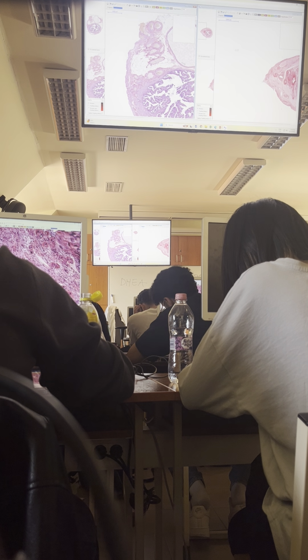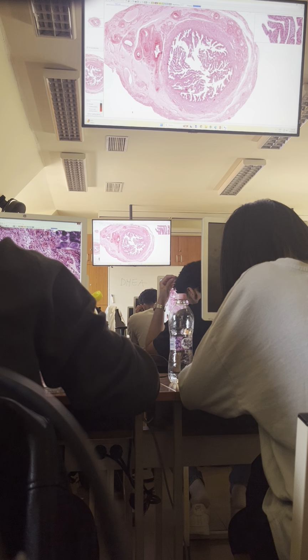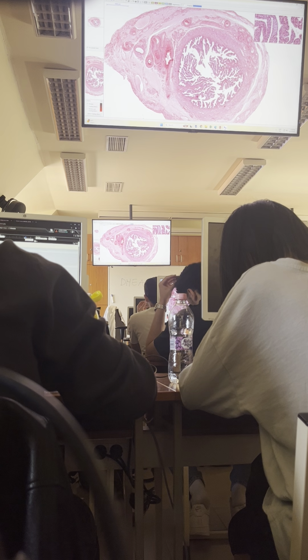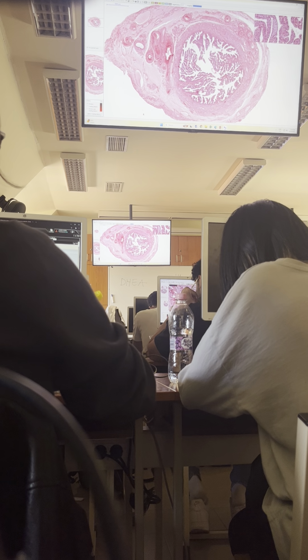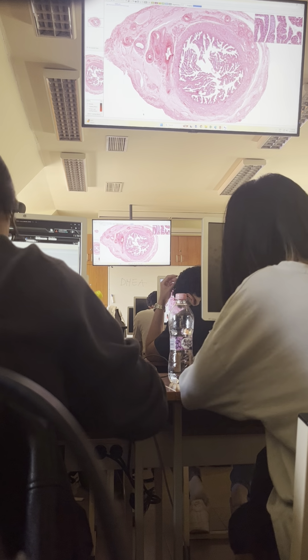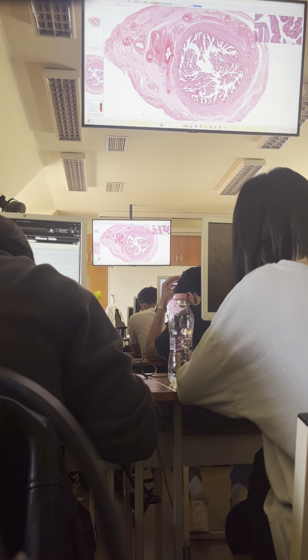So let's go to this 52-59 section, which is the uterine tube again, but in the progesterone phase. Here you cannot see the embryological remnant in this specimen. This is also from the ampulla region, taking the fact that the mucosa is highly labyrinthine here.